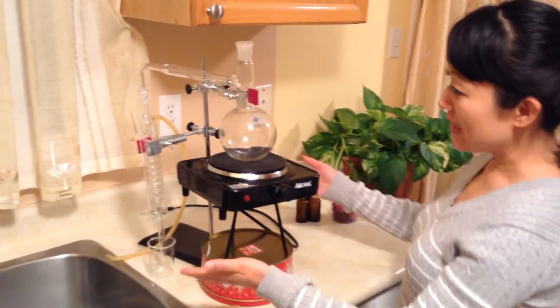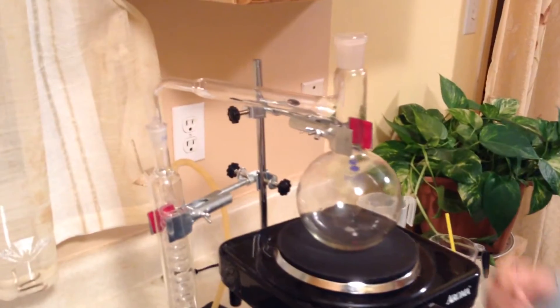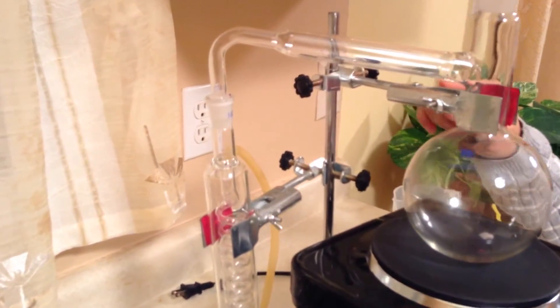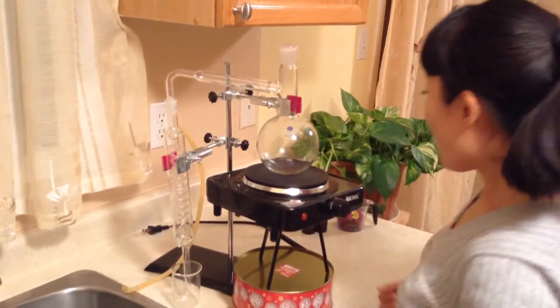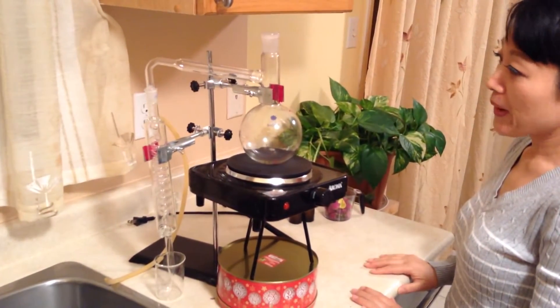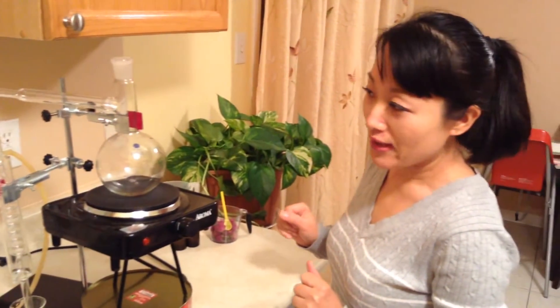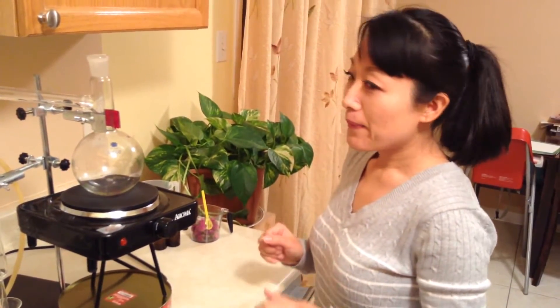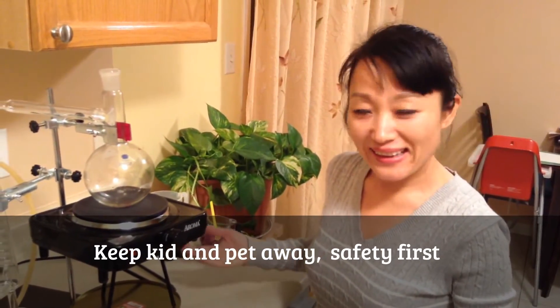For example, you can see the distillation setup. We have two clips — one on the top, and another is a little bit lower. For this setup, make sure safety is very important. Keep the kids away, the pets away. I don't want them to get hurt.